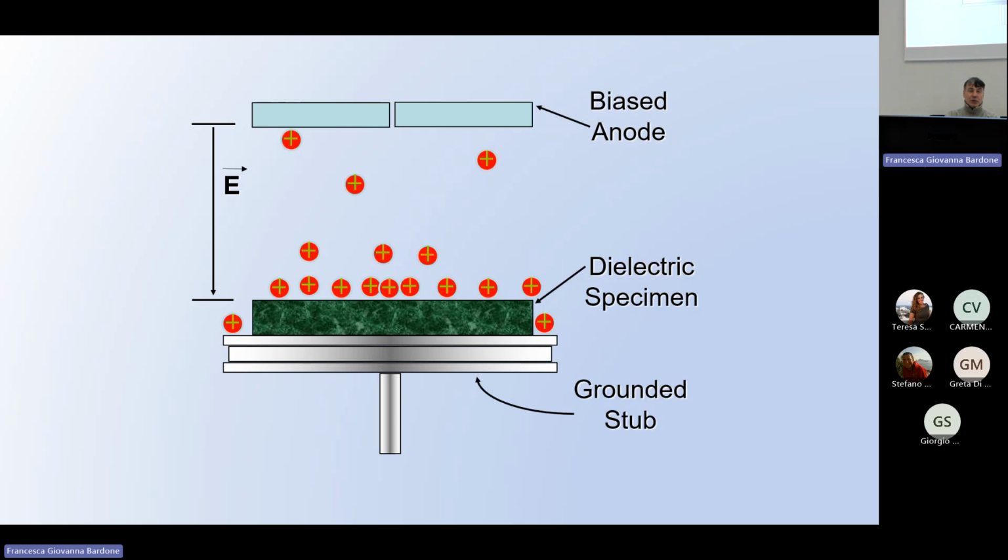And at the same time, you have amplification. So you don't need any external amplification, and the surface is always kept at zero potential. And your molecules always become neutral without needing to change the molecules.